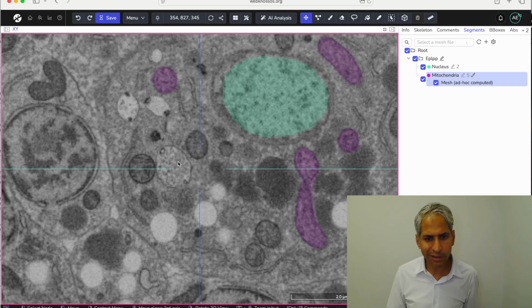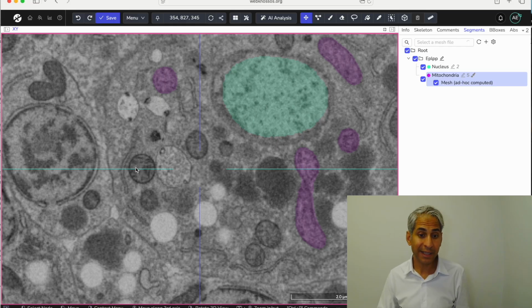One may say, doesn't this look like inner membranes? Okay, I think there's an argument that there's something going on inside here. But these two things and the shade of gray are very different from this, which I'm willing to bet is a spherical mitochondria. So I'm not going to hasten to mark this as a mitochondria. This, though, I would annotate as mitochondria, this as well, and these two, and this, and so forth.